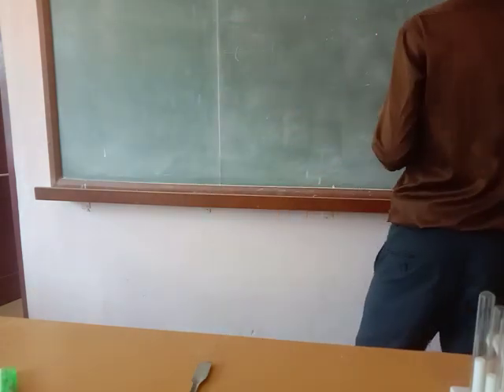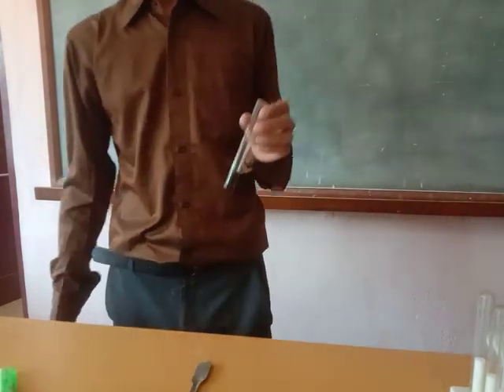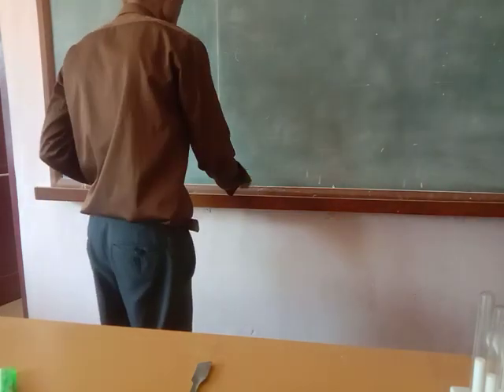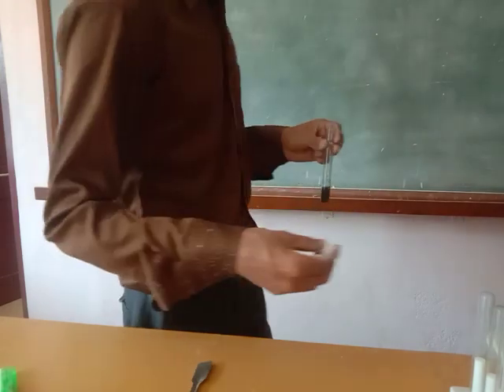In group analysis, we identified that group 2 is present.